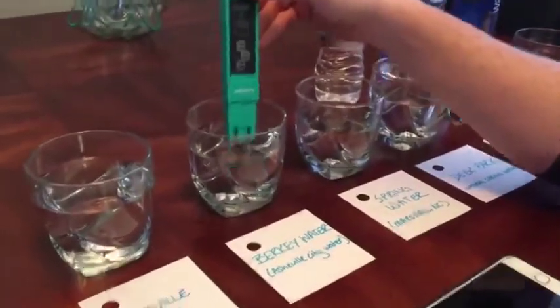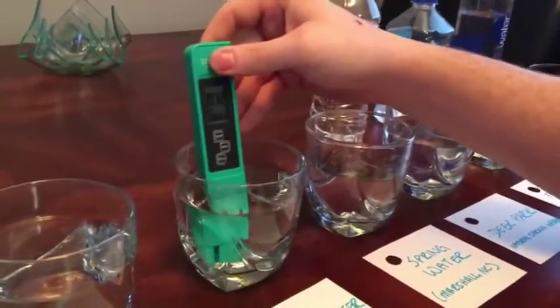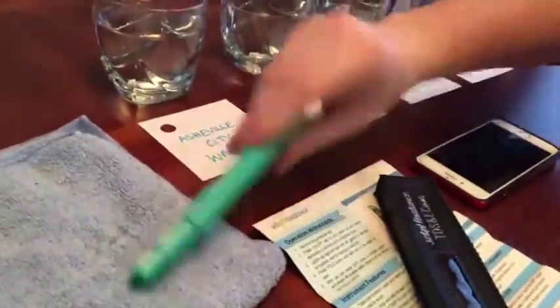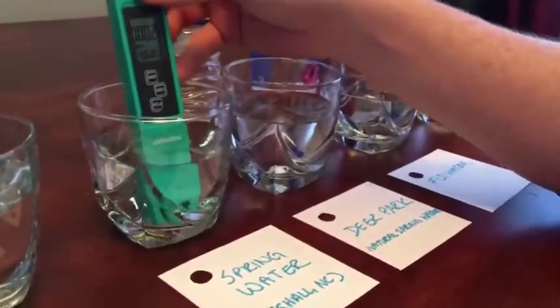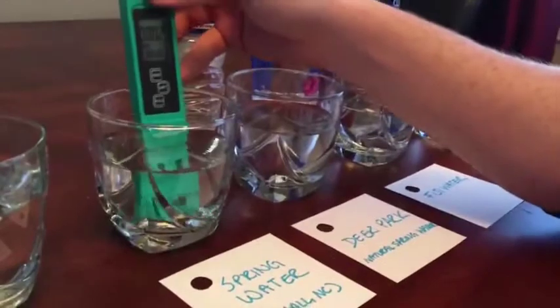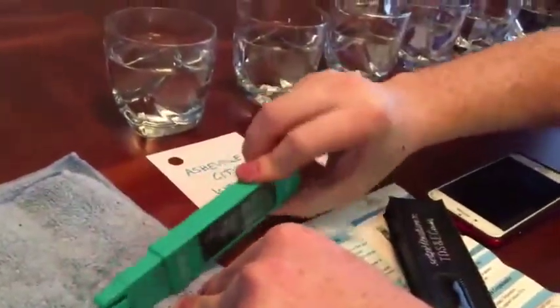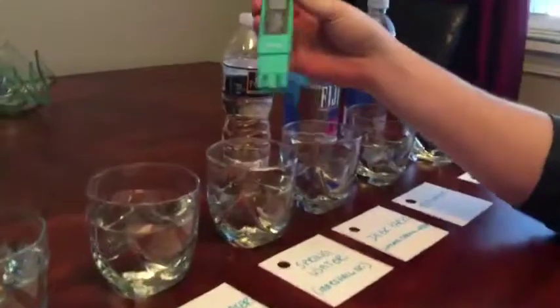This is a great example of how this tool can be used. In this city the water is extremely chlorinated, and if you want to test whether your filter is actually working, this is how you do it. Now we test spring water from Marshall, North Carolina, about 40 minutes away. Remember, zero is ideal for clean water — this natural spring water reads just two parts per million, straight out of the ground with no filter.